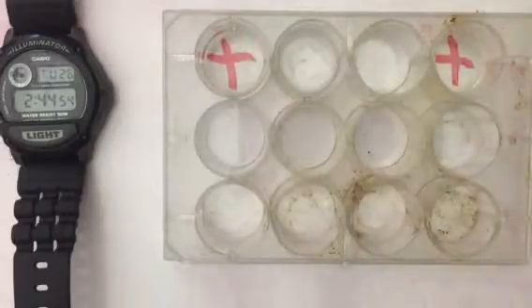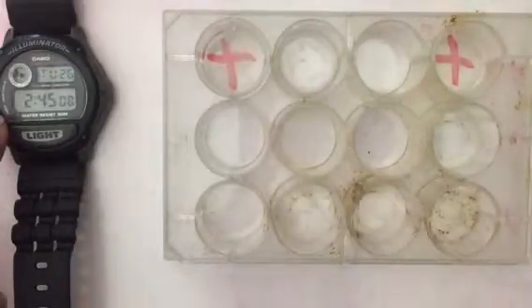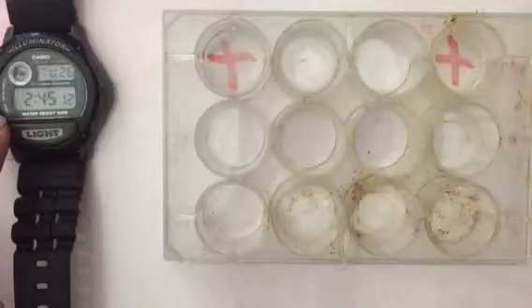And if we only depend on our own eyes, it's going to make it really hard to compare these. But the nice part about this is that this little watch right here gives me a time of when I started the HCl. So I have when it started.